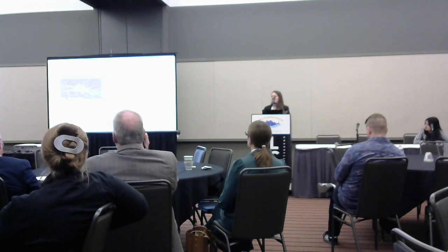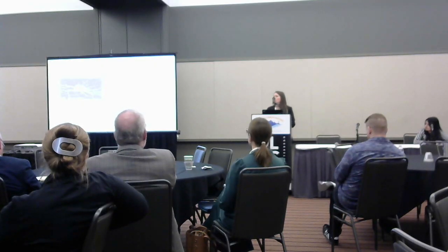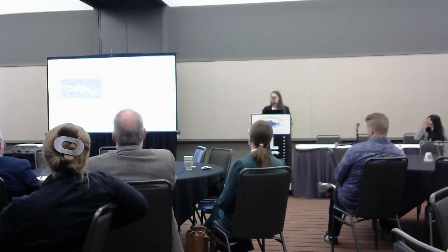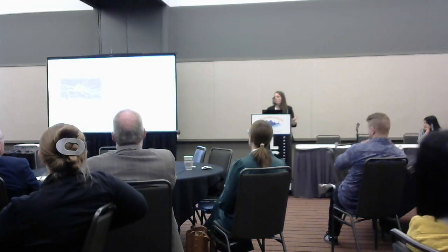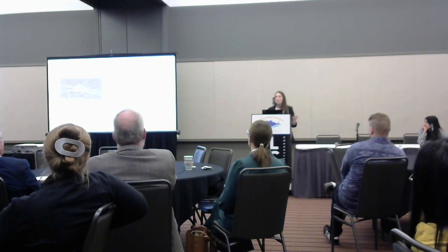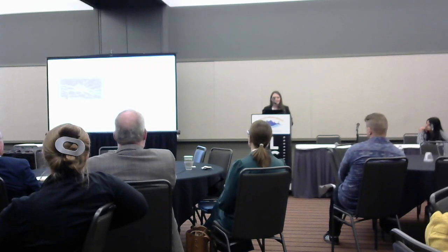But there's more to consider, especially when working with clients. So how easy is the software to use or learn? What is the average learning curve of that software? So something to consider related to this is, are there graphical user interfaces or not? Fiji and Imaris both have great graphical user interfaces that have good documentation, so you can probably make your way through with relative ease. But Python obviously does not, and you have to learn a whole new coding language if this is not what you do every day.